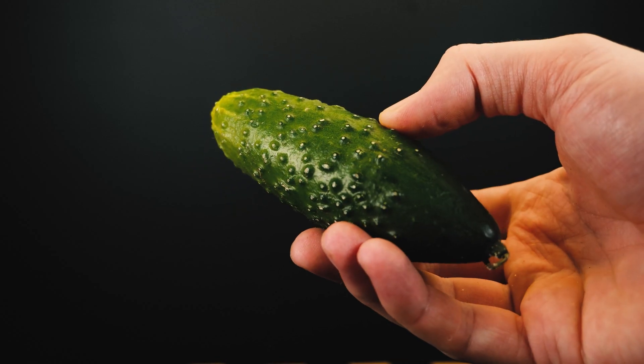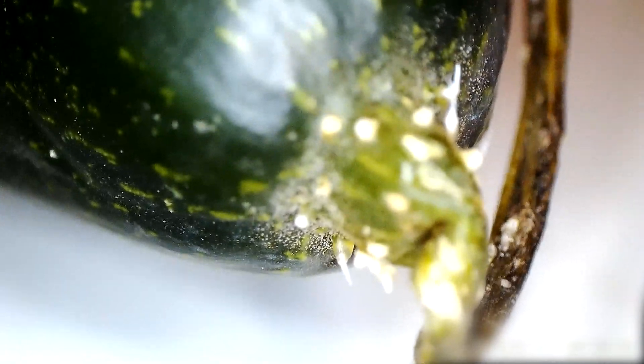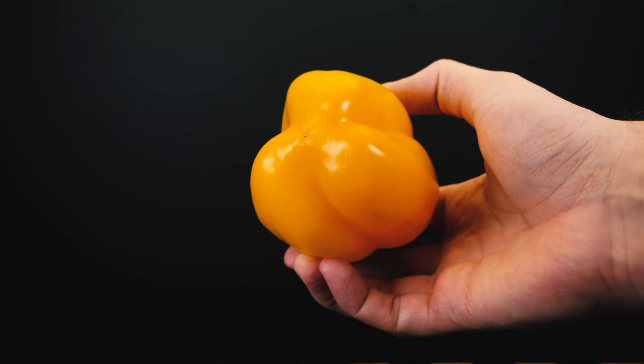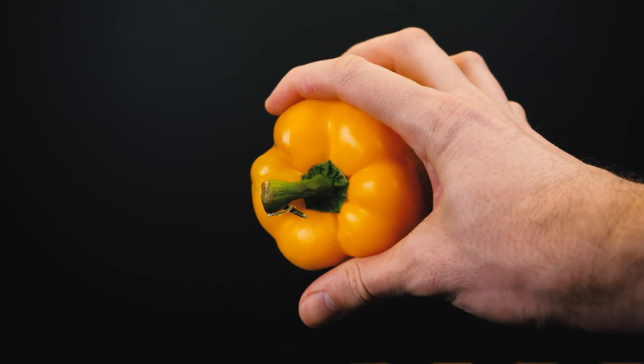The shaggy surface of the kiwi itself looks like this — it looks really unusual. I decided to examine cucumber pimples under a microscope. The cucumber stem looks like this, and the pimples looked like real volcanoes. Next I decided to consider an ordinary sweet yellow pepper, on the stalk of which I also found a small mold. Now do not be surprised if you bought some fruits or vegetables and the next day they became moldy.